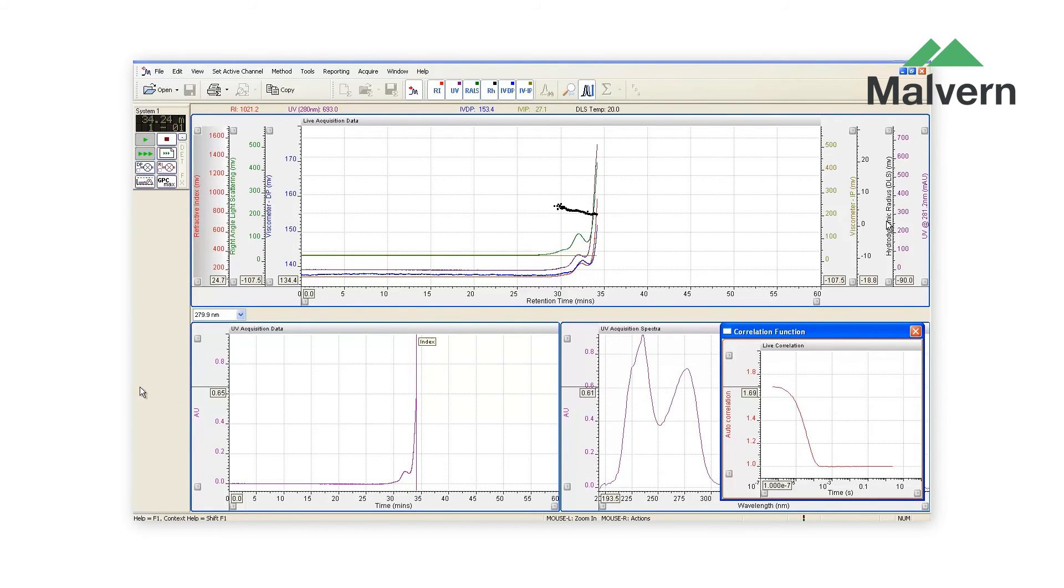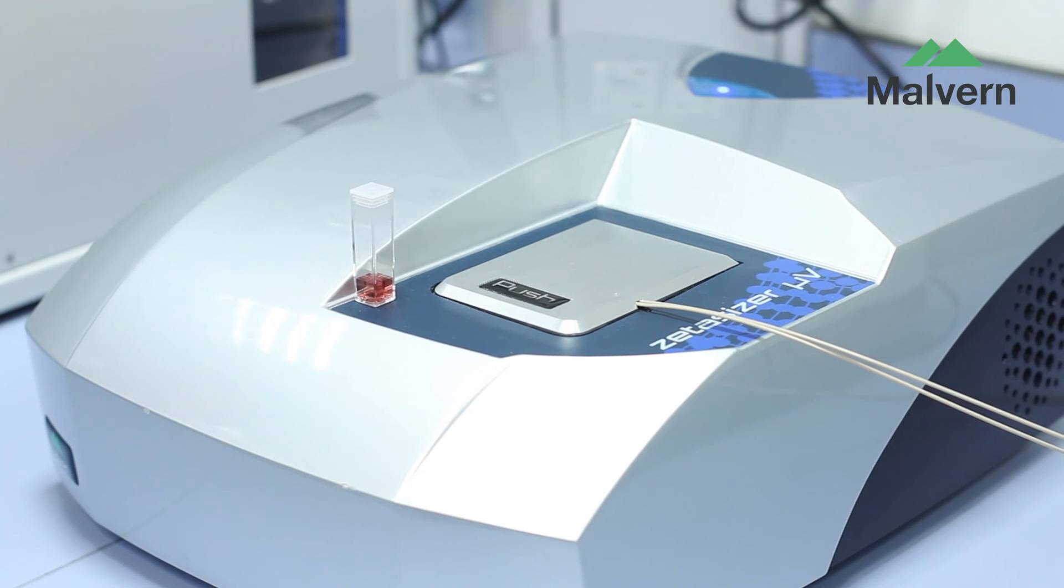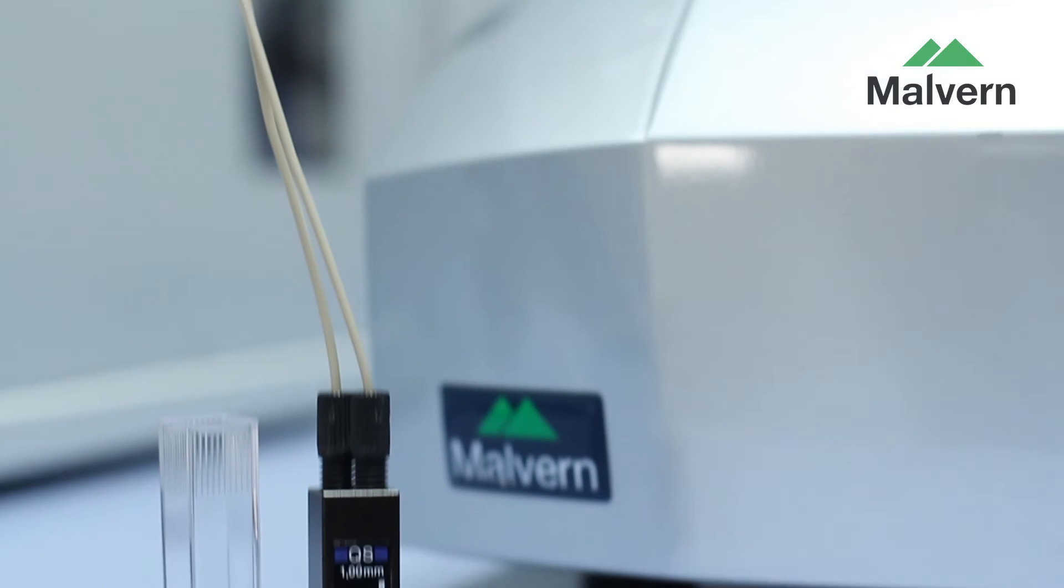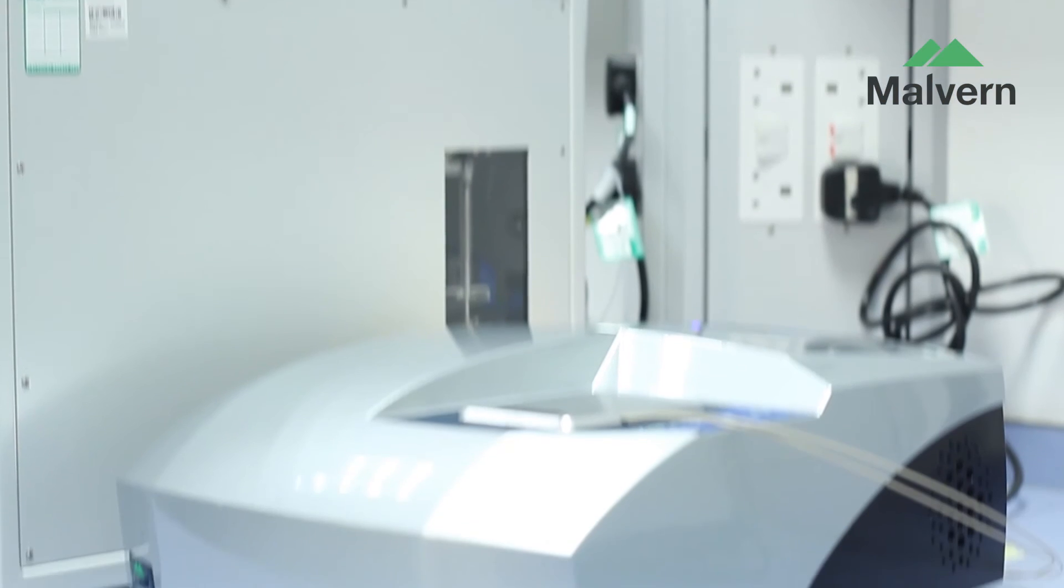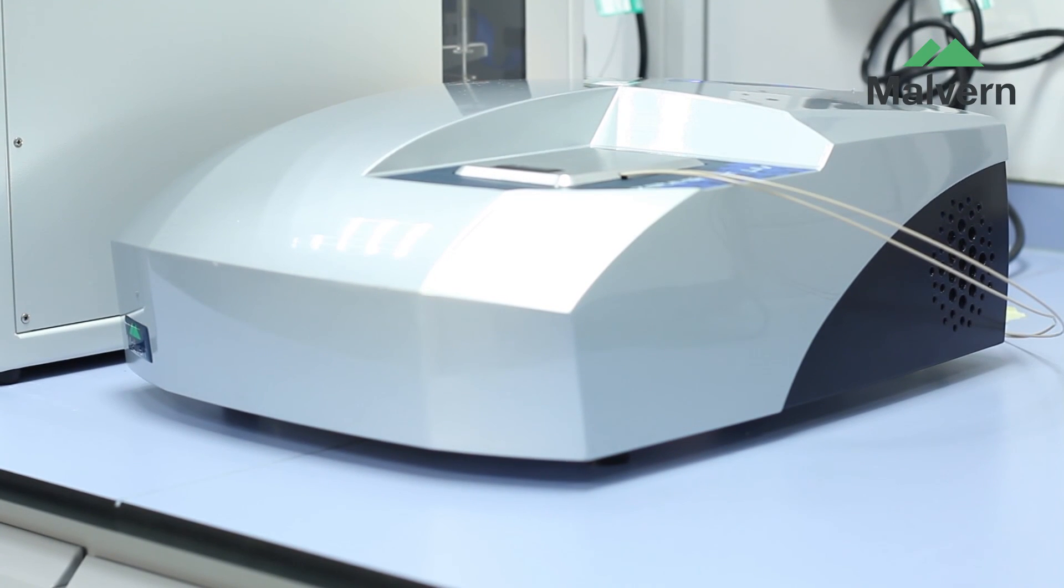The class-leading Omnisec software allows full and rapid access to both raw data and calculated results. For ultimate versatility and sensitivity, the Zetasizer Micro V enhances your capabilities for both batch DLS and SEC measurement of proteins.